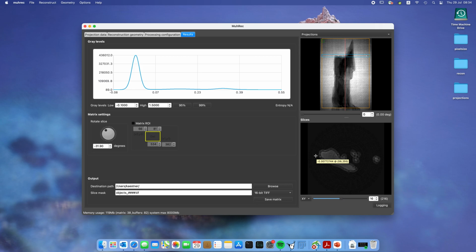So what you can see here, you have the tooltip tells you the position that you're working at. So let's take a position here on the outer edge of this uncertainty region. We see that we are at 79. Then you can move over here and you see that you have about 98.